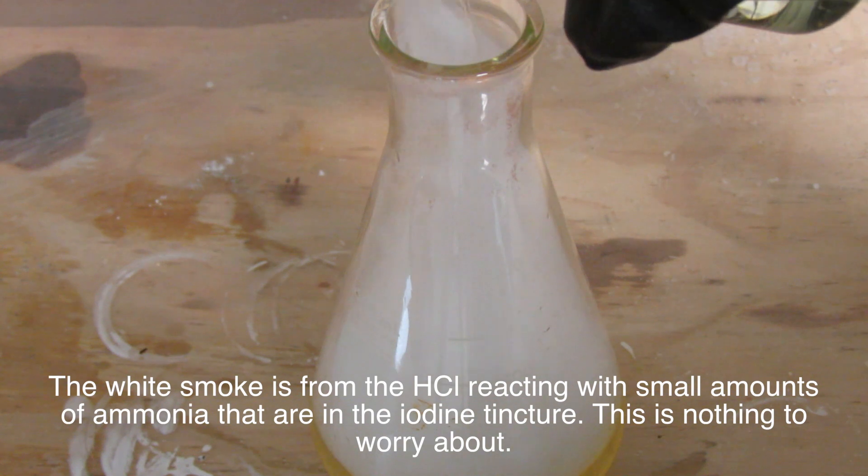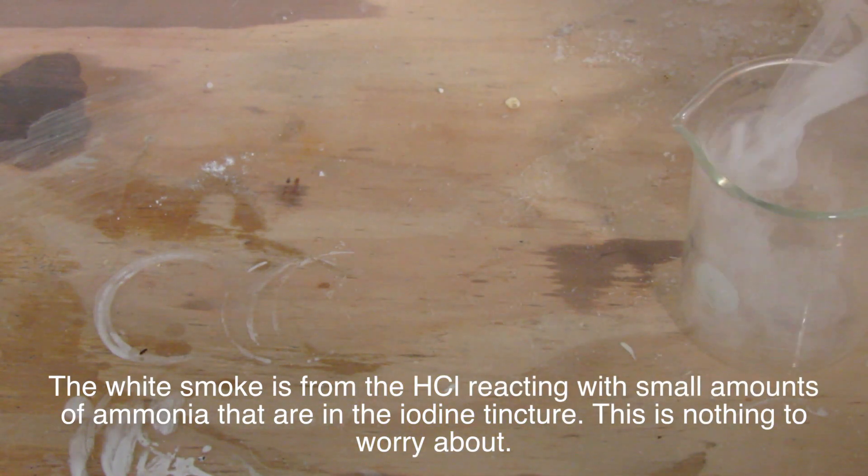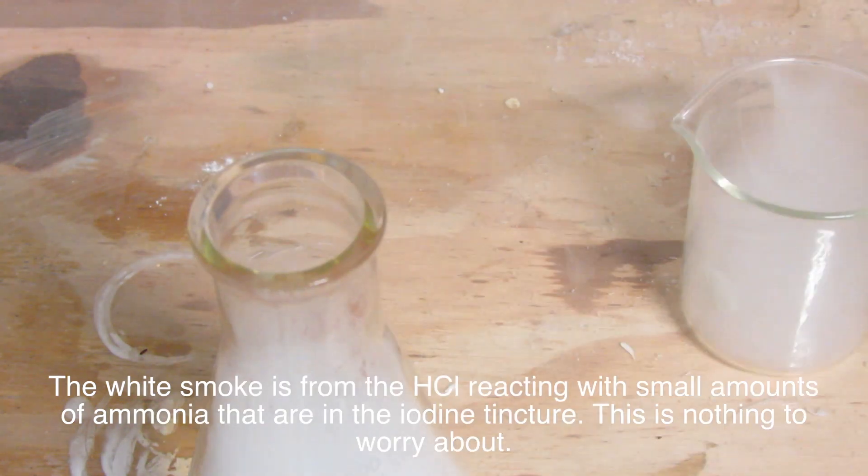Now add 10ml of hydrochloric acid for every 1 fluid ounce of iodine tincture you're using. In my case, I had 4 fluid ounces, so I used 40ml.